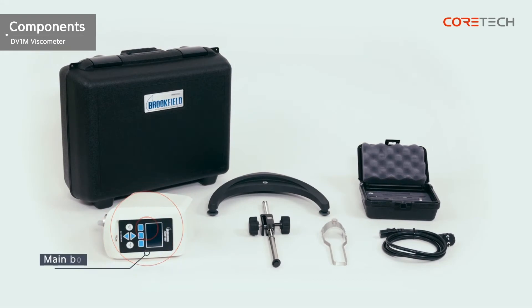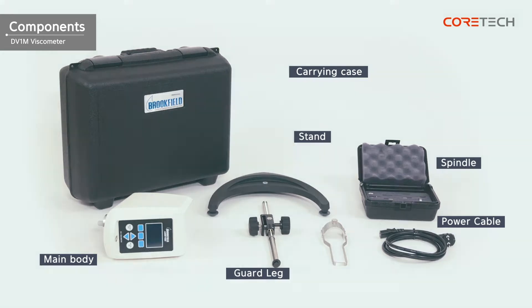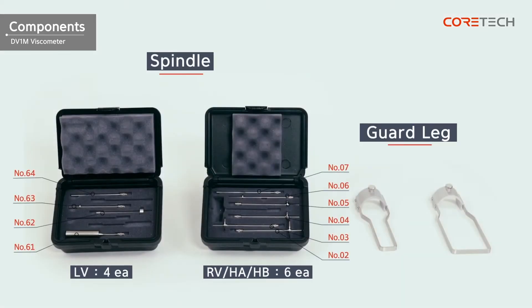The components include the main body, stand, spindle, spindle guard rack, power cable, and carrying case. DV1M HA and DV1M HB models do not have spindle guard racks. DV1M LV has 4 basic spindles, while the other models have 6 spindles. The guard racks in DV1M LV and DV1M RV are different shapes and are incompatible with each other.